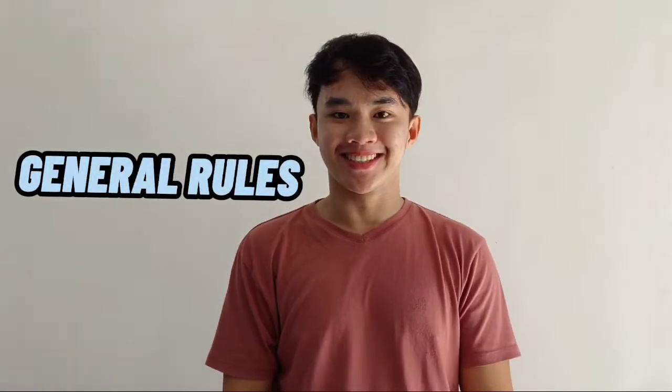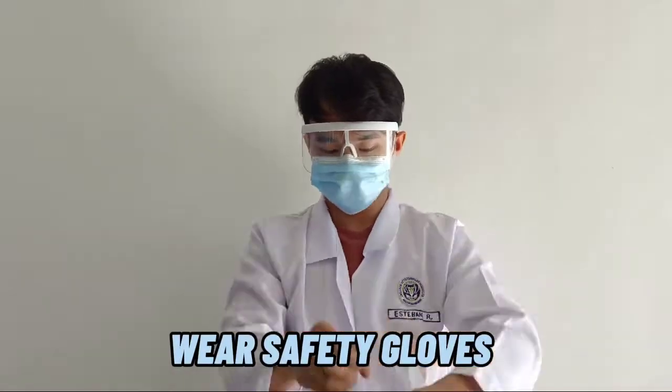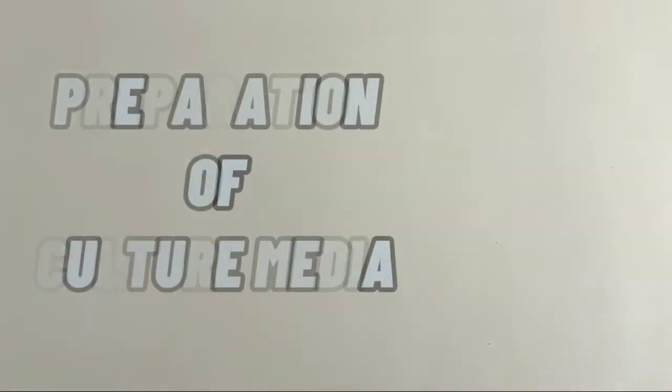Hi, I'm Ryan and these are the general rules. Wear laboratory coat, wear face mask and safety goggles, and lastly, wear safety gloves. And we're done! Let's proceed to Preparation of Culture Media.